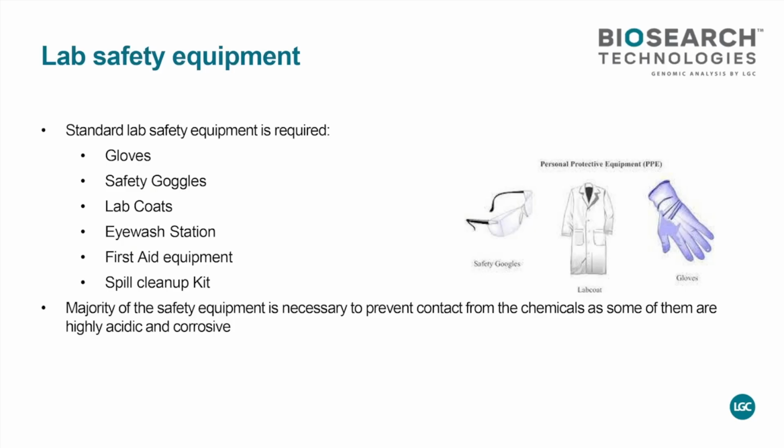So lab safety equipment, this is not something I need to tell you about. If you ever worked in a lab, you know all about personal protective equipment. Make sure that you always wear goggles when you work with the synthesis reagents. It's not very much fun to get acetonitrile in your eyes. It burns. Other ones, I'm not going to even go there. Your clothing, you spill oxidizer on it, it's not coming off.